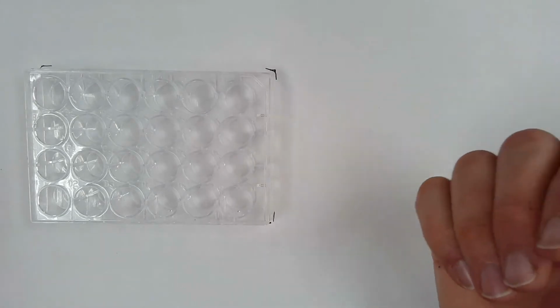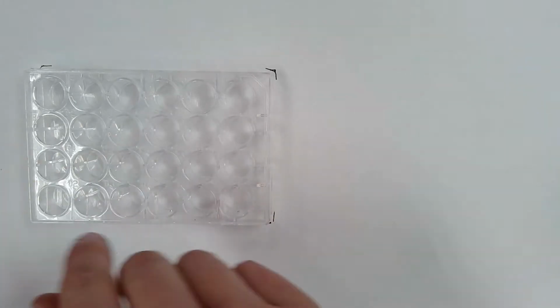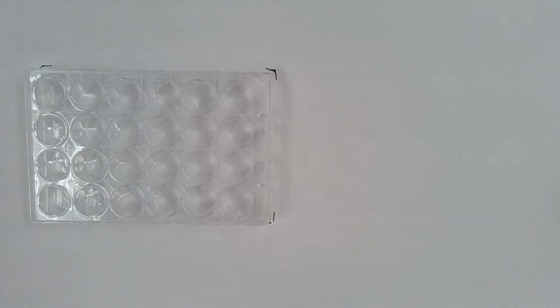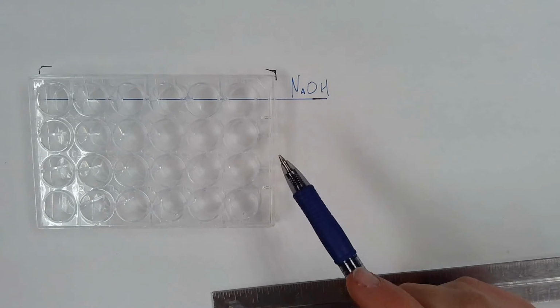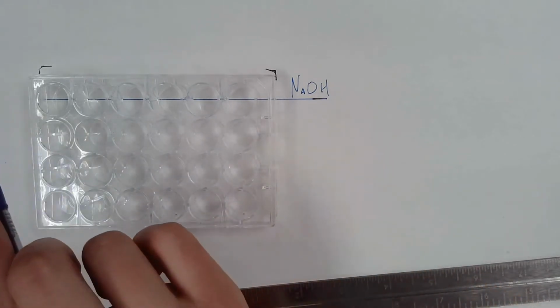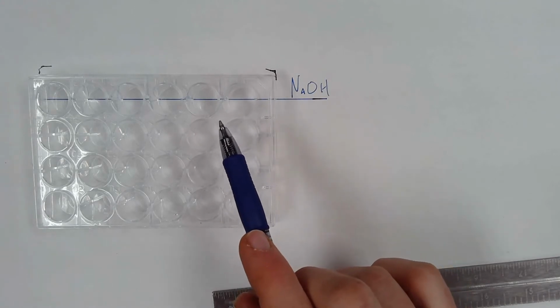So I think you can see what's going to happen, but we made 9 chemicals, and we're basically going to make some rows and columns where things can cross. So let's set up a first row here. So my first of these are all going to be filled with sodium hydroxide.